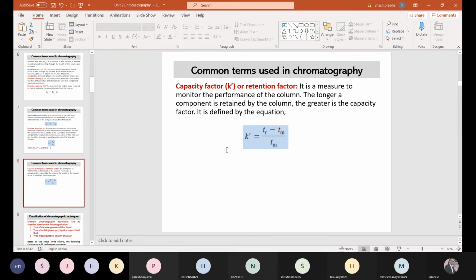Two things I want to emphasize: chromatography is a relative technique, it's not an absolute technique. You cannot come to know the name of the component just through chromatography, through the peaks in the chromatogram. You need to compare it with a standard which is run in the same identical conditions, so that you can match your retention times, so that dead time does not change. Because dead time is a very critical thing. It can change with column, with flow rate, with injection volume, etc. And secondly, the efficiency of separation in chromatography has to be such that it fulfills all the criteria of chromatography. It baseline separates all the analytes, but within the shortest possible time, which will give you a more efficient chromatography.